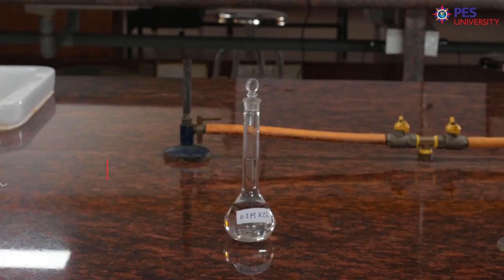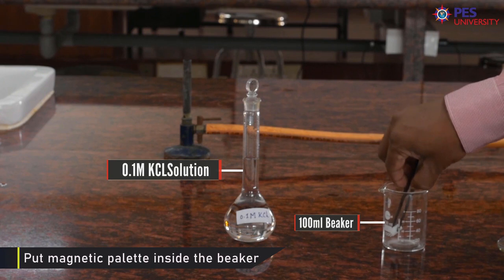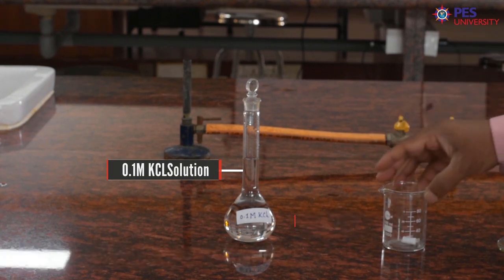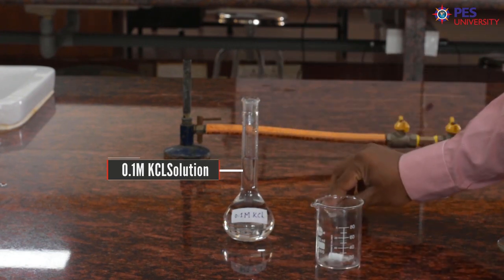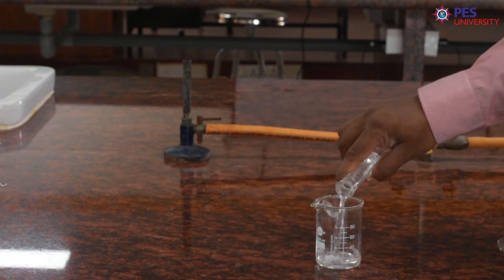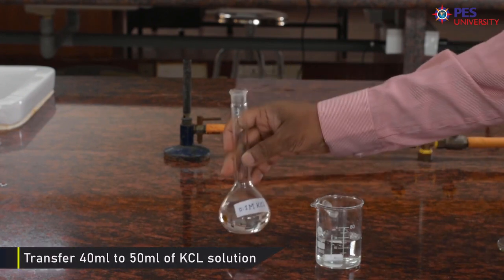After preparing 0.1 molar KCl solution, take a 100 ml beaker, then keep the magnetic pellet inside the beaker slowly. Then transfer this 0.1 molar KCl solution into this 100 ml beaker slowly. You can take roughly about 40 to 50 ml of KCl solution.